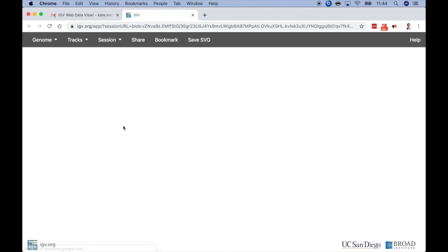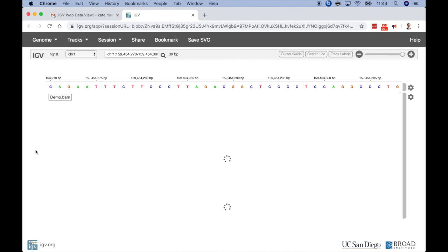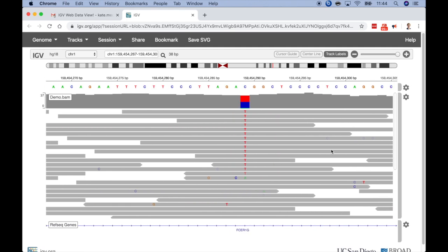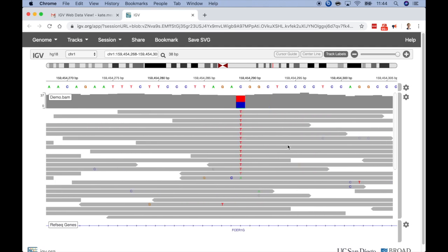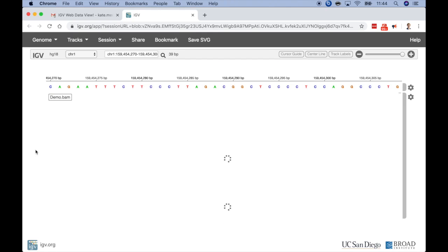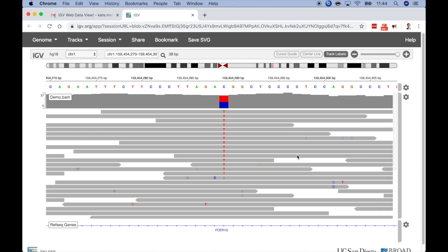The URL encodes all the information necessary to reproduce the view, but it does not copy the data. Instead, the URL provides a link to it — in this case, a link to the publicly available files in Dropbox. Note that this shared data view is a regular IGV session, with the exception that when the page is reloaded, it will return to the precise data view that the URL points to.